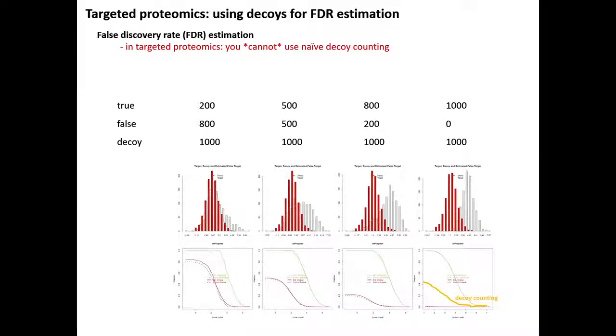There is a second level of false identifications that we can now start to figure out, which is when the DDA identification is wrong because it's a chimeric spectrum coming from two peptides. In DIA, you actually penalize them because you see that these are two peaks and two different features. So these types of mistakes from the DDA we can solve in DIA, but for a wrong label on top of a true peptide, there is very little we can do about it. This is something you drag down from DDA, and you need to be very stringent with protein FDR on the DDA library to not carry those along to DIA.